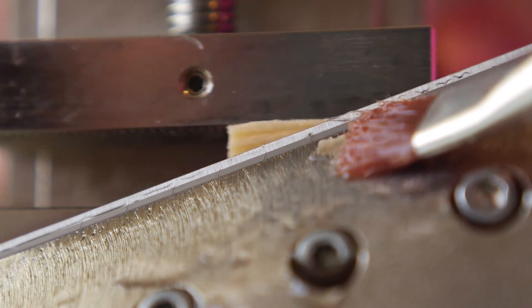Sometimes the glue around the slice stays attached to the glue around the sample. Therefore, you regularly have to remove superfluous glue around the sample with an additional knife.